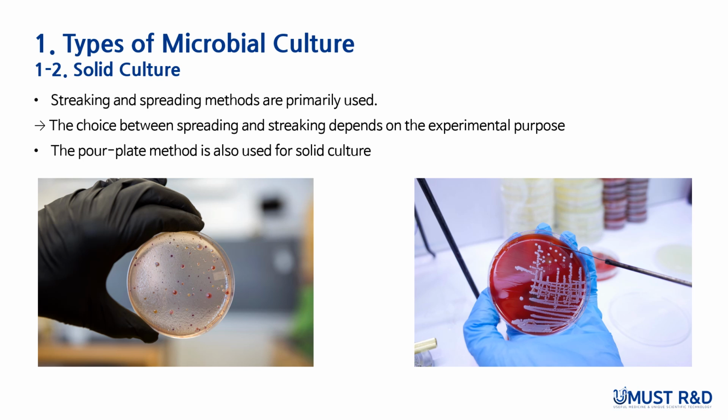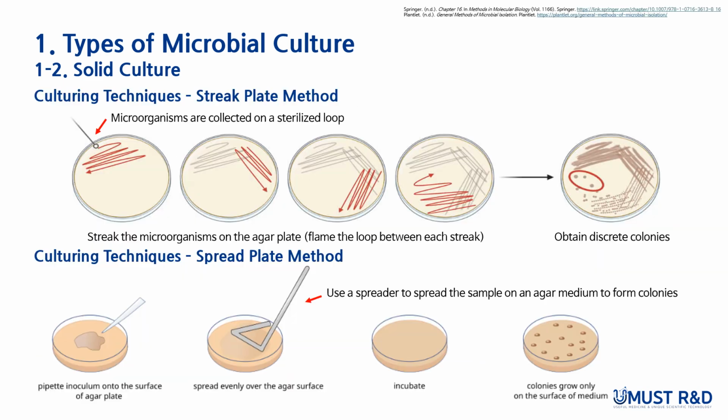Solid culture is primarily performed using the streaking and spreading methods, with the choice of technique depending on the experimental objectives. The pour plate culture is another method that mixes microorganisms within the medium itself. The images below show actual results from solid culture experiments.